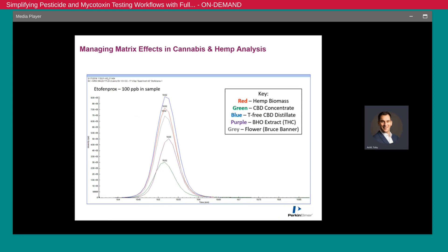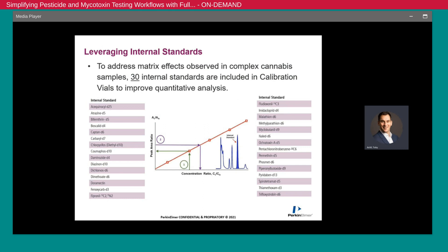We also appreciated that cannabis samples and cannabis matrix types have a significant influence on performance in the instrument. We can see five different cannabis and CBD samples of five different matrices having various degrees of ion suppression in the mass spectrometer. To mitigate and improve data quality for this test, we included 30 internal standards into the same reagent kit, which allow you to quantitate very low level pesticide and mycotoxin residues in a challenging cannabis matrix. Being able to source the internal standards at the same time as the calibration standards also means the lab can work with much more efficient processes.